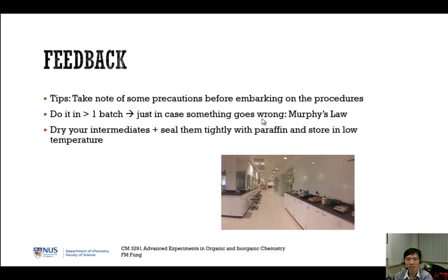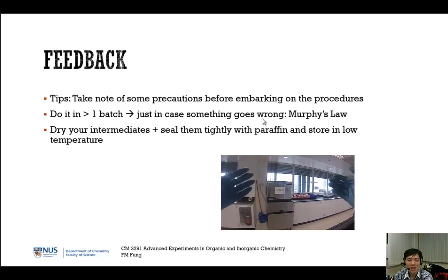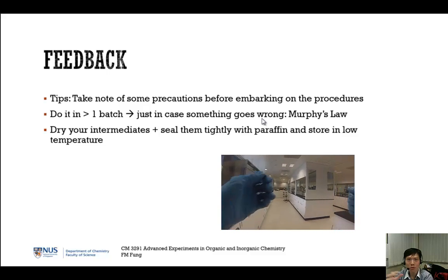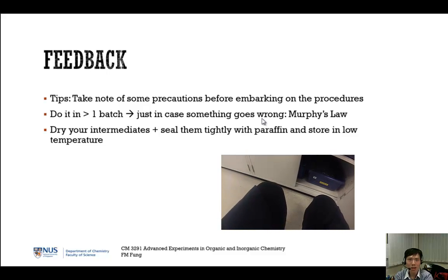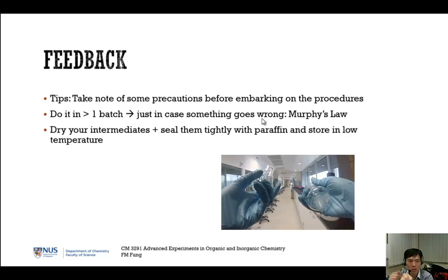So suppose the solvent is not able to be stored in the 250 ml round bottom flask. What do you do? You add a bit less solvent, but with more reagents. How does it affect the reaction rate? You remember collision theory? You're having a higher concentration, so molecules bombard at a faster rate, and you have more chances of effective collision frequency, right?